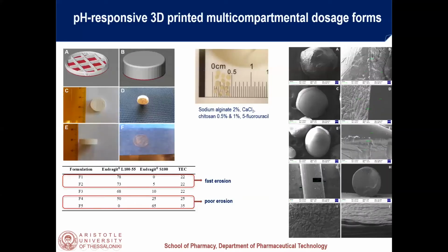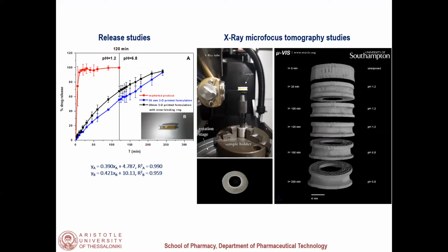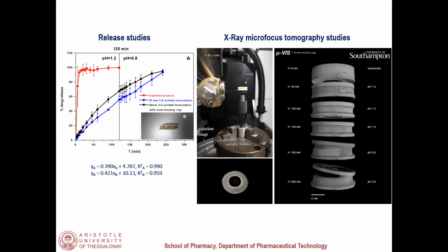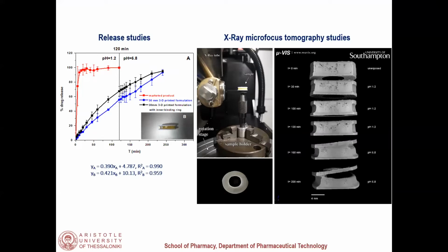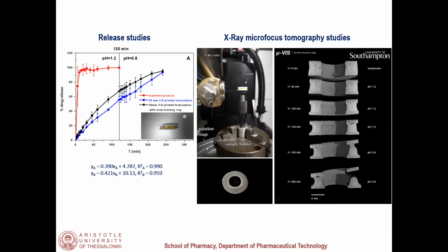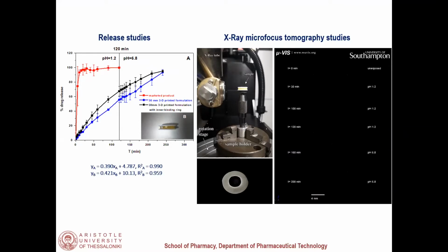We complemented this study also with time-lapsed X-ray microfocus computer tomography. So in essence, we did exactly the same protocol. We did the dissolution test, but at different time points, we removed the sample from the medium and tested it in the X-ray instrument in order to see what the mechanism of the dissolution is.